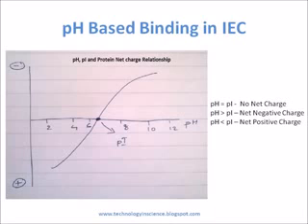The ionic state of these groups is highly dependent on the pH, and as a result, the net surface charge of a protein will undergo a change as the pH of their environment varies. At the isoelectric point, the protein will have little or no tendency to bind either to a cationic stationary phase or to an anionic stationary phase. At pH values below the pI, the protein will have a net positive charge, and will tend to bind reversibly to the surface of a cation exchange resin, that is, one that has negatively charged groups at that pH.